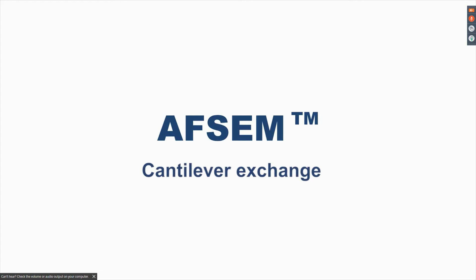In this video, I would like to show you how quickly and easily a cantilever can be replaced by a new one when working with the AFSEM. For those of you who are familiar with optical cantilevers, you know that exchanging optical cantilevers requires quite some dexterity and skill, and then of course time to do the laser adjustment. I'm not saying that you don't need any dexterity at all with self-sensing cantilevers. However, they make things much easier for you, and thus also the AFSEM system quite easy and intuitive to handle.